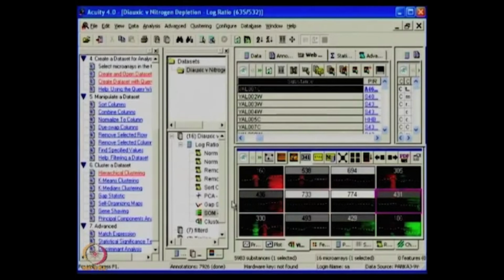Okay. So because I have given 4 into 3, I will be able to see 4 into 3, so 4 columns and 3 rows. Right. So independently they are being divided, so one can have any numbers. The idea comes from the hierarchical, but as you see here, the clustering gives an immediate response: okay, this was very low in these ones, again it went down, and you are able to see it again up. So in different time codes it's a different expression. Correct. So based on the behaviors you can see that, okay, this is being grouped with.